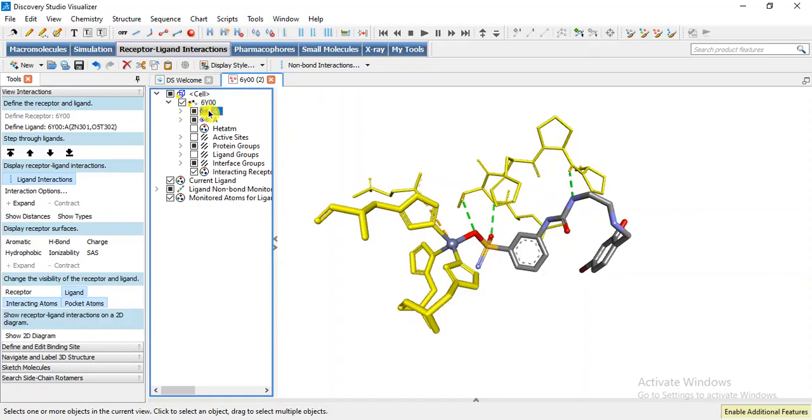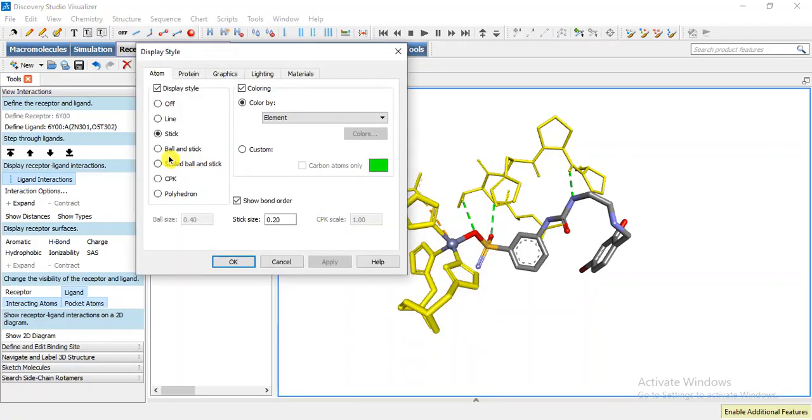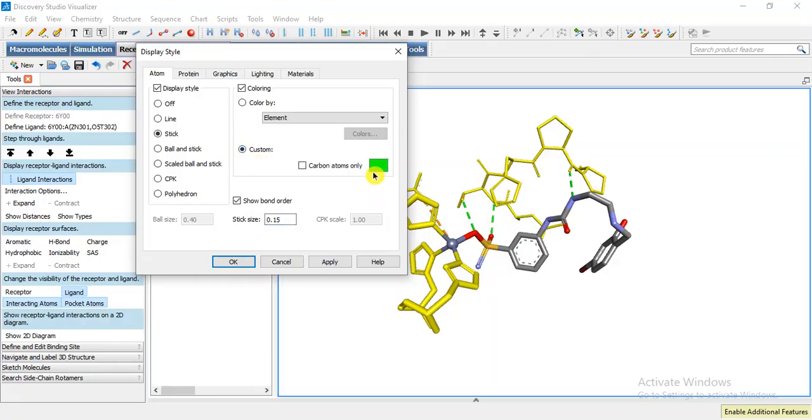These are with different width sizes. So right click display style stick model. I am going to change here the size of the stick. It is 0.15. We can change the color of these residues only.